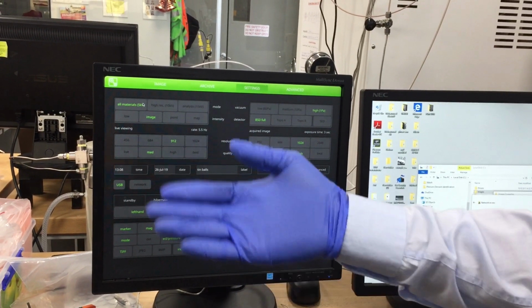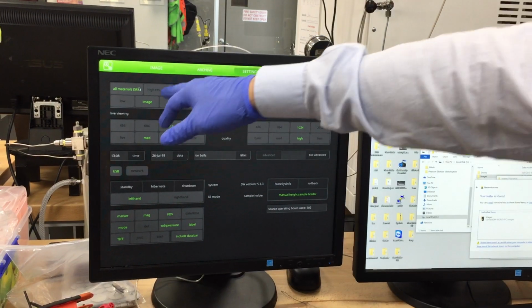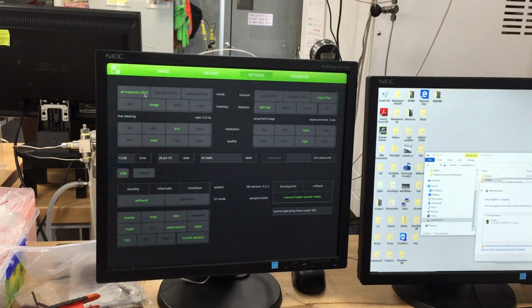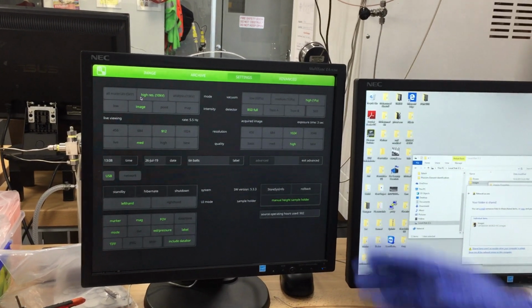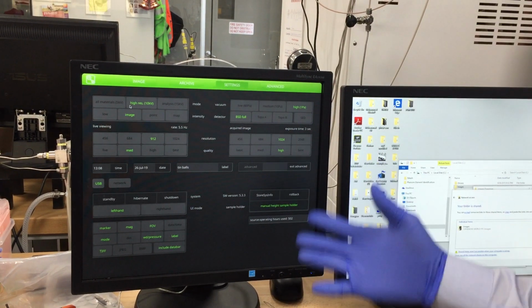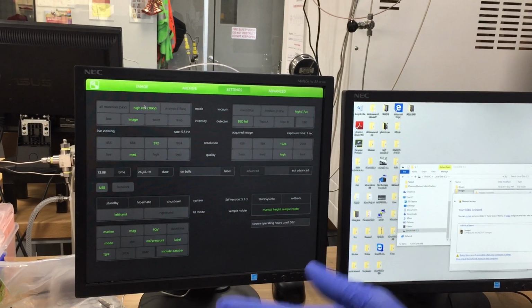It might be sand, it could be plastic, things that are not easily earthed. The issue with using only 5 kV is that you don't get as good a signal to noise ratio as 10 kV. But the problem with 10 kV is that you are pumping even more electrons, and if something is not conductive and earthed properly, then you're going to have the charging problem, like I said before. So you can choose between 5 kV and 10 kV, depending on how the sample is behaving.